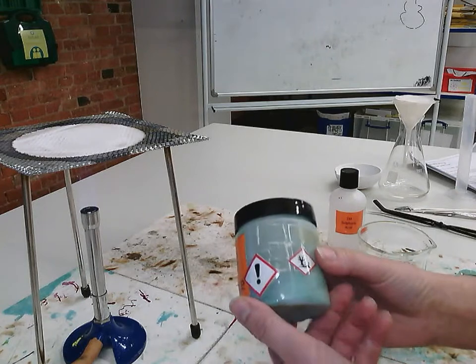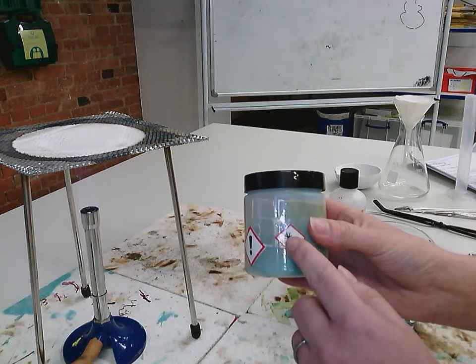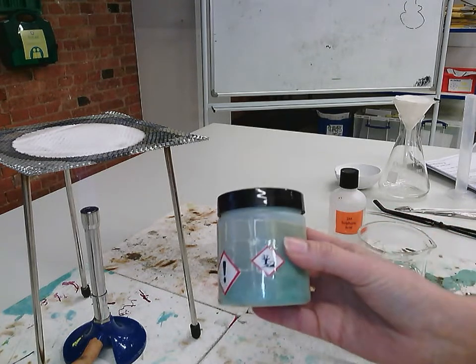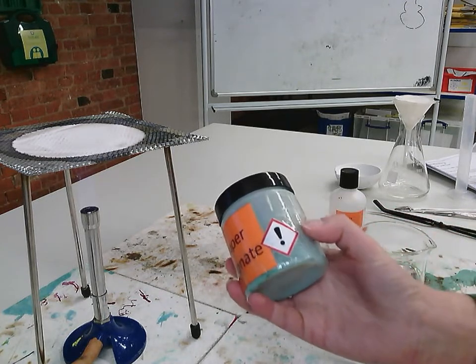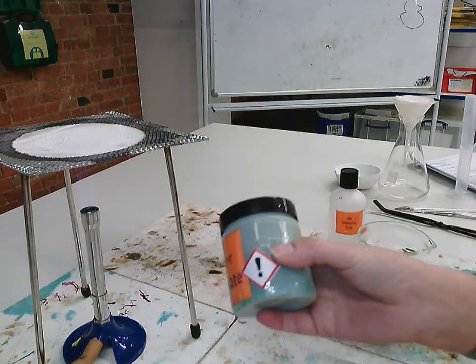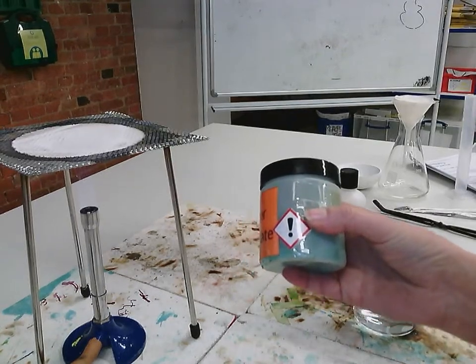We're also using copper carbonate. Now you can see it's got a picture of environmental hazards, so it's got a dead fish and a dead tree. This means it's not going down the sink when we're done. And it's got an exclamation mark. This means irritant, so if it gets on the skin or in my eyes or if I breathe it in, it will cause a mild irritation.